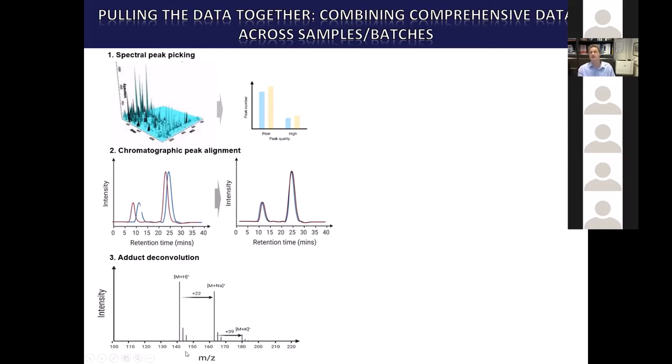So we're interested in the abundance, and it's really the aggregate of those signals that we're interested in. We need software, because this is going to be the case for every compound feature that we measure across many samples, that's thousands and thousands of signals. We need to automate that process, and so we capture all of that in an automated way. There's software from instrument manufacturers, and there's also independent software that's really well developed to do all of this for us, in a way that we can view what's happening and dig in if we don't believe it's doing a great job. But in general, the software is very good at all of this.